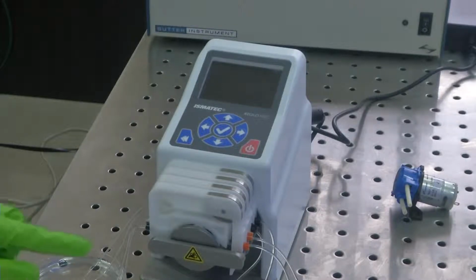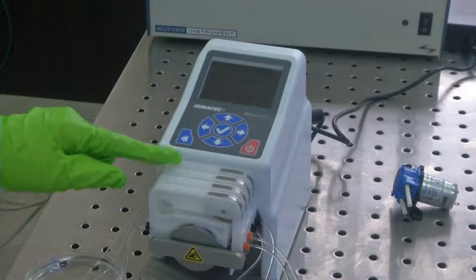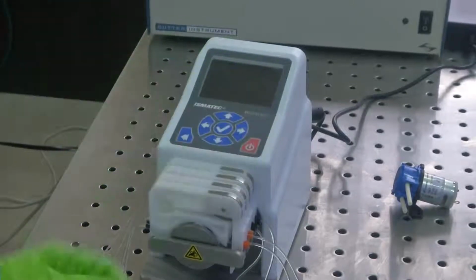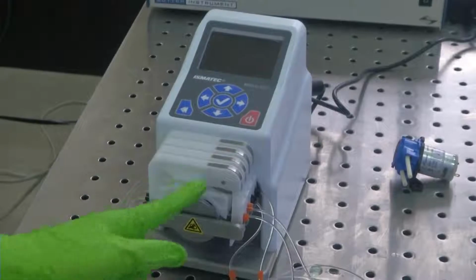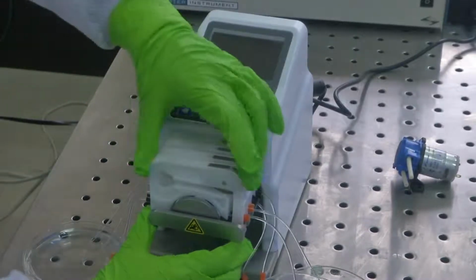Let's see how the tube has been placed inside. As you can see here, there are 4 cassettes, 1, 2, 3 and 4. Even before we turn it on, let us have a look at how the tubings are placed inside each of these cassettes. We have Suman who would be helping us.